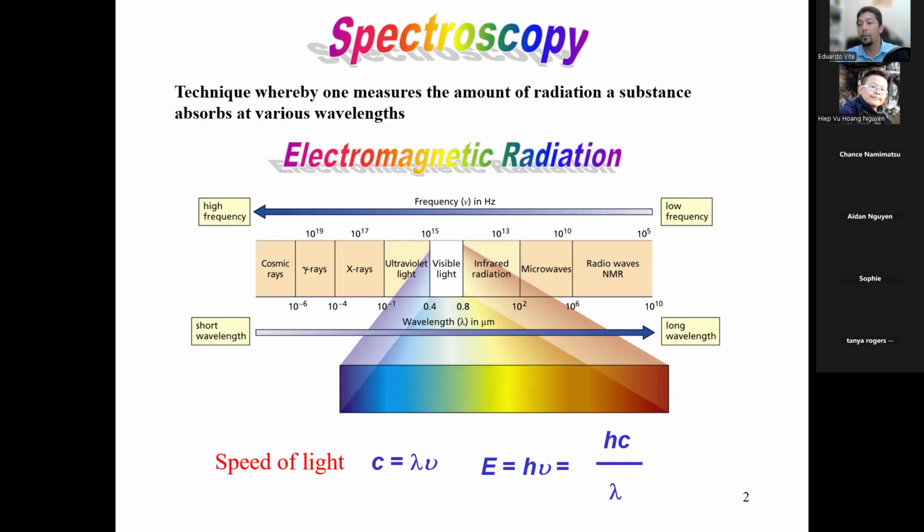And the opposite is true. When something has a low frequency, when it's a long wave that takes a long time to go up and down, that has low energy. And so visible light from blue to red, blue has the highest energy, red has lower energy, but red has the longer wavelength. All right, they're inversely related, frequency and wavelength. So that means that infrared has lower energy than the color red. Make sense? And ultraviolet has more energy than the color violet. And everything below or above that has more or less energy respectively.